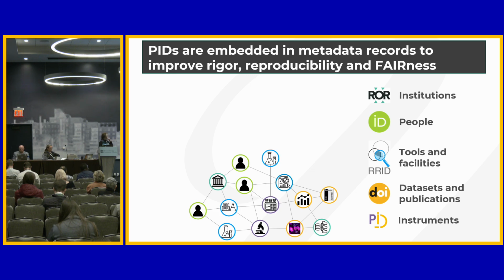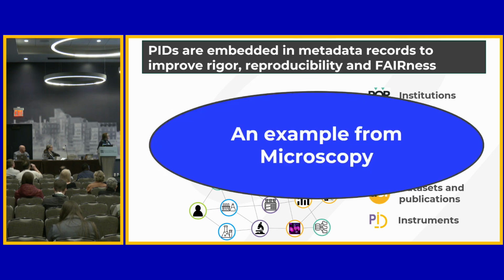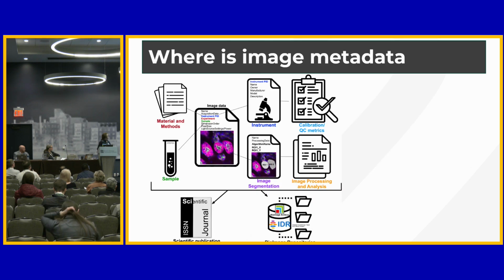Then the PIDs, then you can link to the instrument the data that was produced and the paper that was used, that came out of that research. So that all of this stuff can be connected, and then you can imagine that this network can become really big.